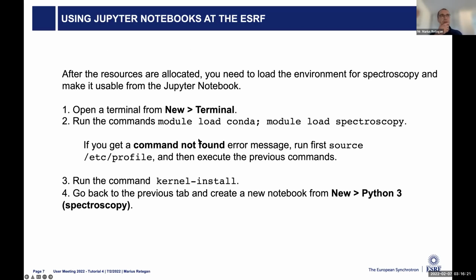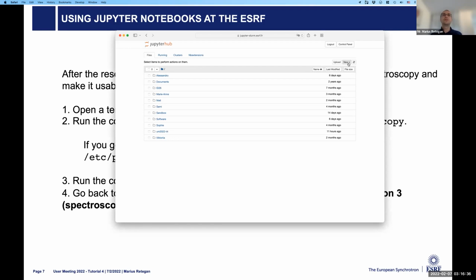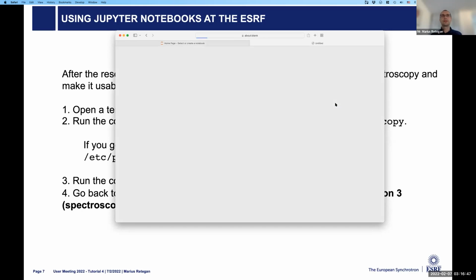Okay, so now we have resources in order to use some of these libraries that we're going to use today for data analysis. You have to do the following. Go here to new, and then terminal. It should open a new tab.